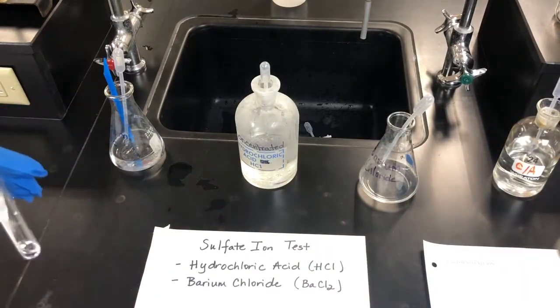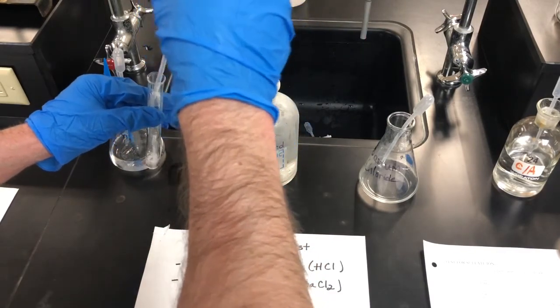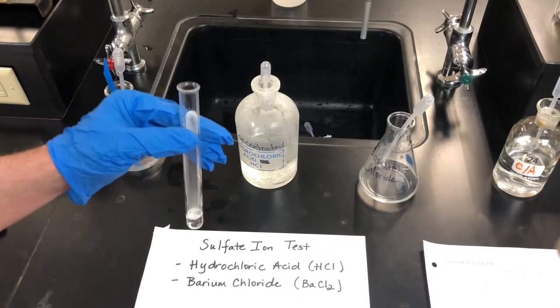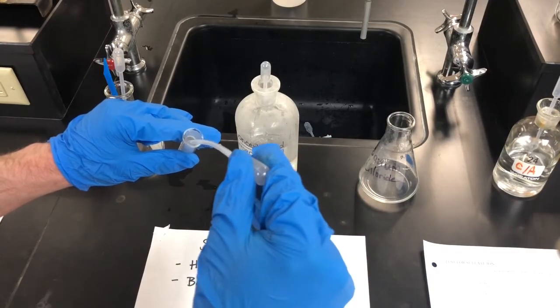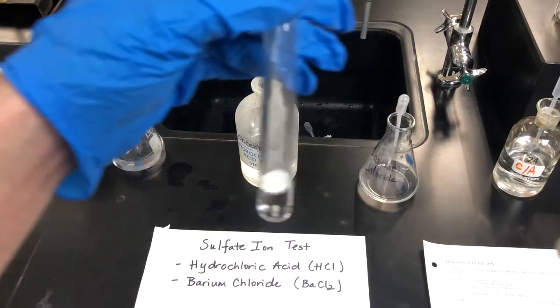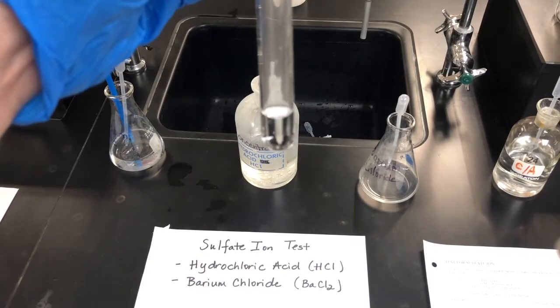We're going to take 1 to 2 milliliters of hydrochloric acid. Squirt. And we're going to take 10 drops of barium chloride. So we'll do a squirt. Okay. As we can tell, nothing happened. Okay, so it didn't turn white. So this is going to be negative for the sulfate ion.